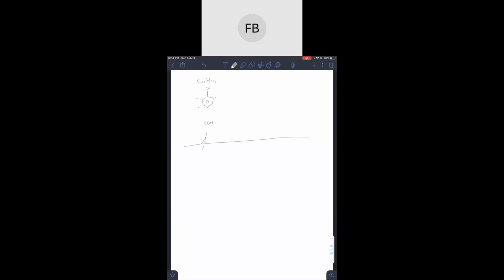So we can see that here he has a 2 singlet, and here he has a, what is that? I'm awfully confused. Oh, a 9 singlet. Okay, perfect. So let's continue down here. So we know that there is an aromatic ring with something coming off. So far we have 1, 2, 3, 4, 5, 6. Let's just say 7. So we have 7 carbons.